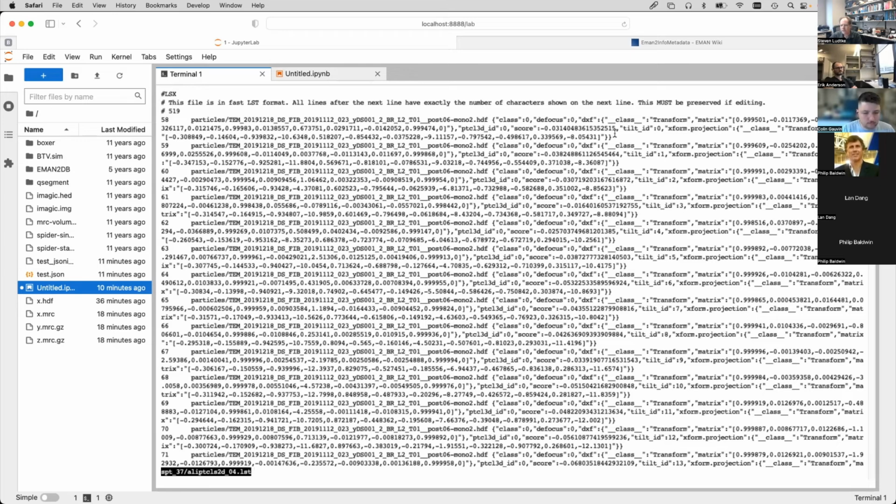So anyway, this is the new mechanism that we're moving to in the future. There's a human readable file which contains all of the relevant header data that's changing all the time. All the fixed header data, which doesn't ever change, is still stored in the header object of the original image. From a programming perspective, it's completely transparent. If you read from this LSX file, it will read the original header, and then overwrite any of the header information with information that's stored in this file. So you have a nice, easy to manipulate text file.